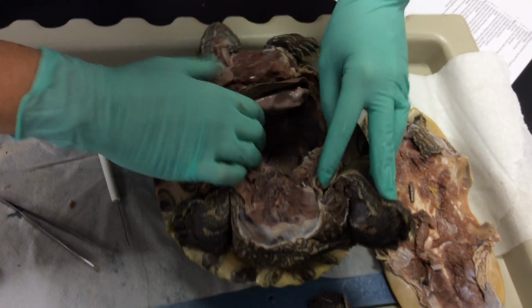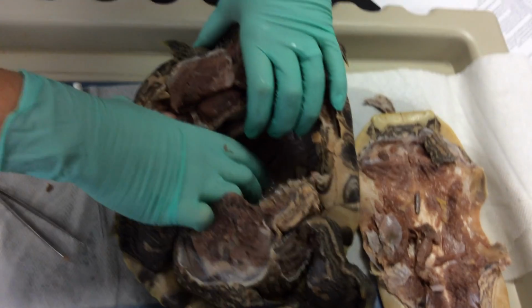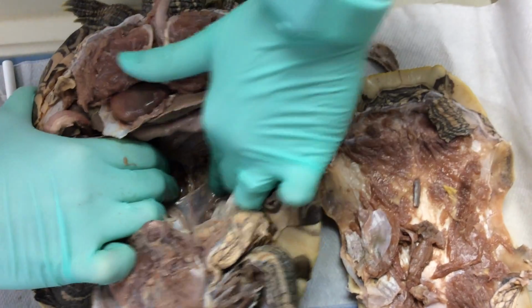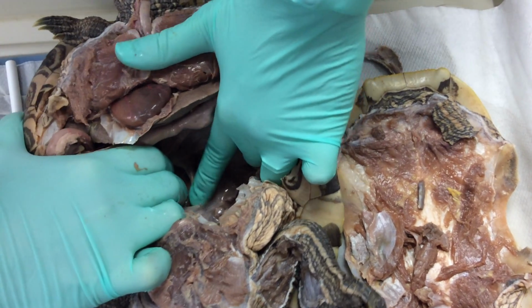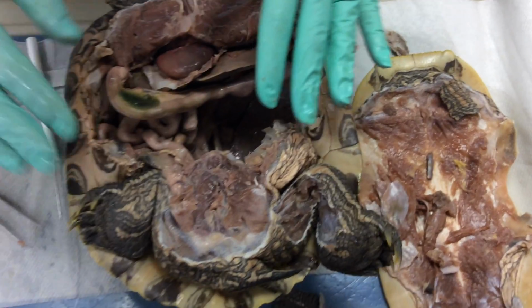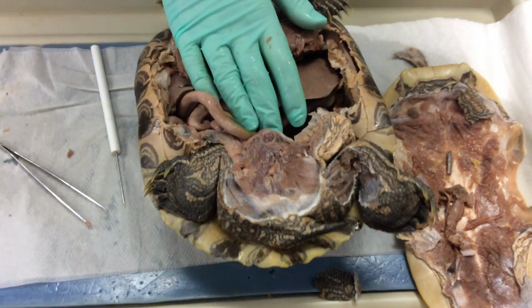Now, something that you need to note is that there is a vertebral column, and the vertebral column is all the way down here in the back. It's actually attached to the carapace itself, so it's fused together. We're going to look at a male.